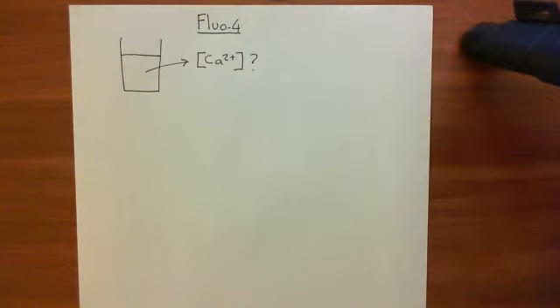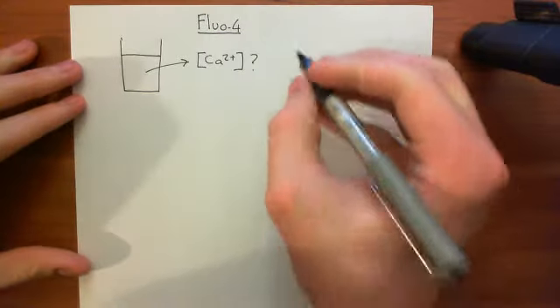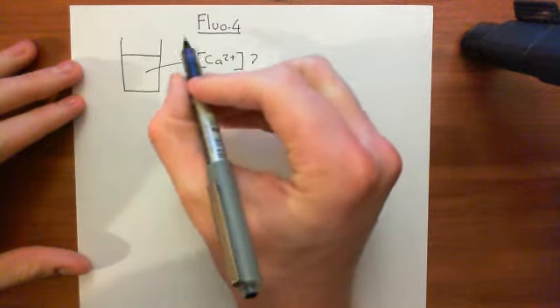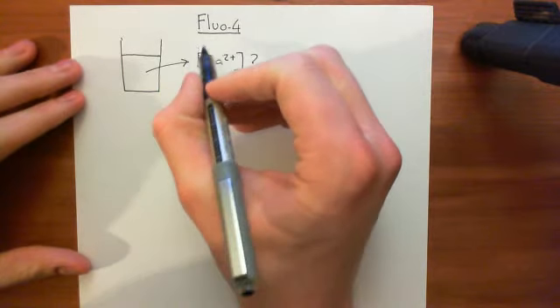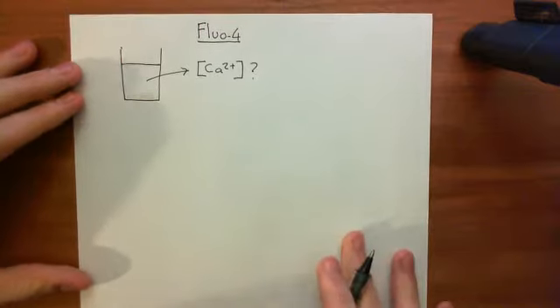Okay, so we're going to start off with a discussion of fluorescence, okay, because Fluo-4 is a fluorophore, hence the name Fluo, and the fluorescence properties of Fluo-4 are going to be increased when it binds to calcium, and that is how we're going to measure the calcium concentration, by looking at the increase in the fluorescence of Fluo-4.